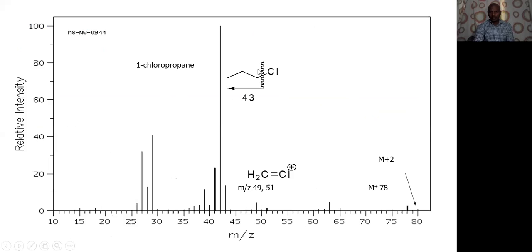Okay, and then coming to the examples, if you see here, chloropropane, you have loss of the halide, loss of X. Then you have the m/z value 43. Here you can see in the mass spectrum of chloropropane the possible fragments we are trying to find out. One fragmentation that happens is loss of X, which we already discussed. This is a prominent one, loss of X as a radical. Then you have the m/z value at 43, and that represents the alkyl cation fragment.